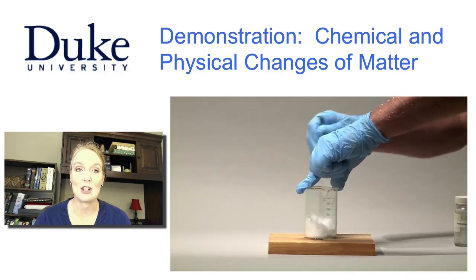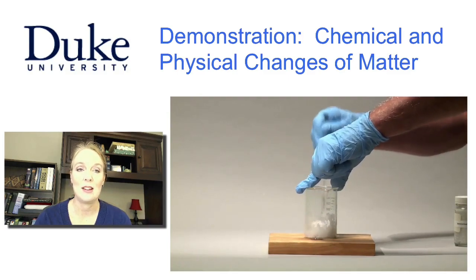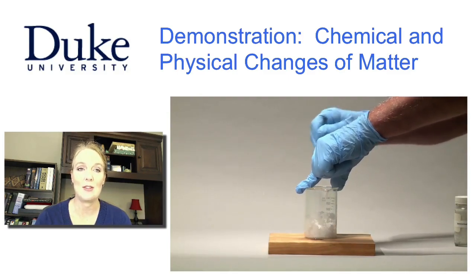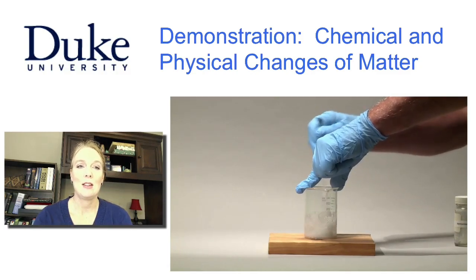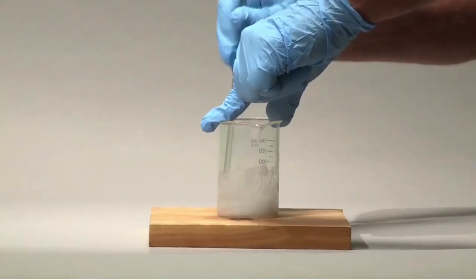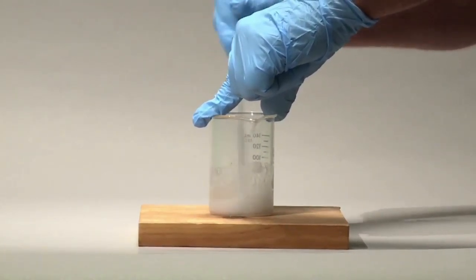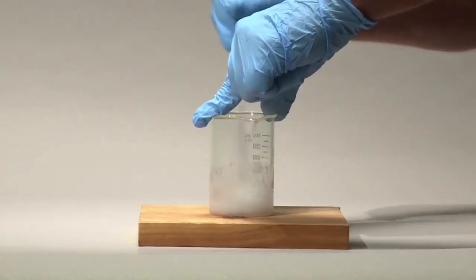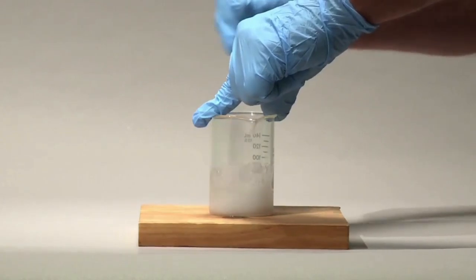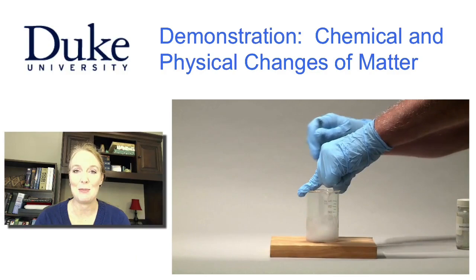This particular reaction is an unusual reaction because it occurs between two solids, and often solids tend not to react very quickly with one another. What do you observe happening to the mixture as he's stirring it? Did you notice that it is getting kind of slushy or wet? This is because water is a product of the reaction. Water is a common product in many acid-base reactions, although not in all of them.